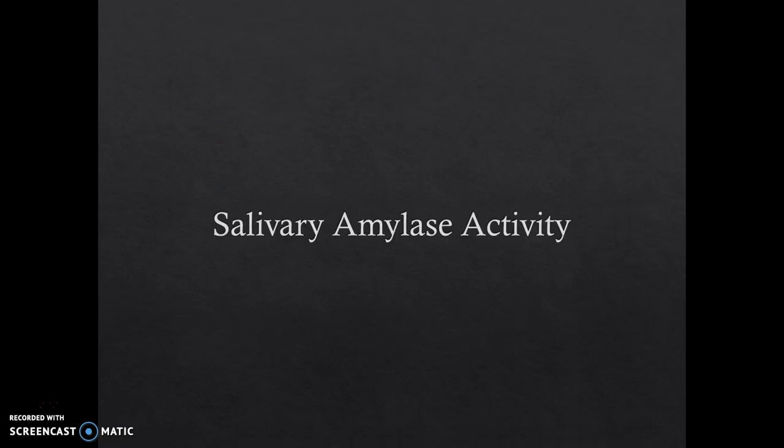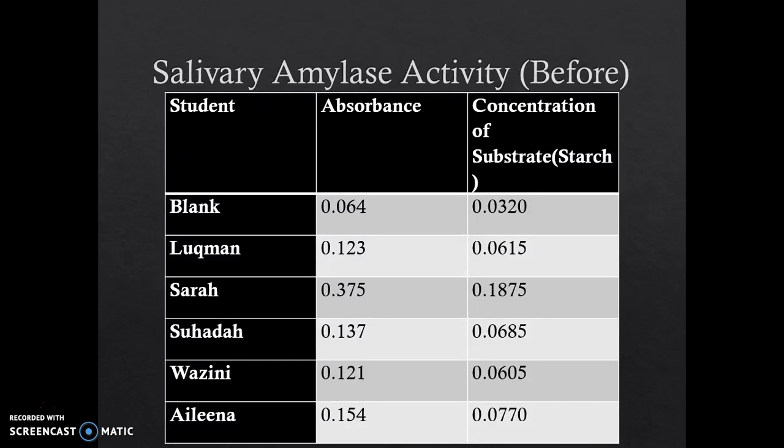For the first activity, salivary amylase activity, we collected saliva from each of us, then we observed and compared before and after the stress activity. Here is the result.